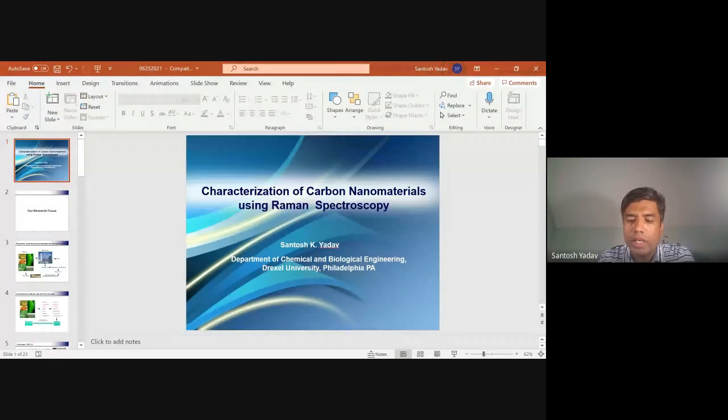So anyway, I'm going to present today the characterization of carbon nanomaterials using Raman Spectroscopy.